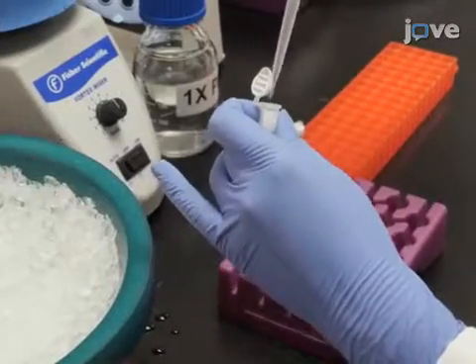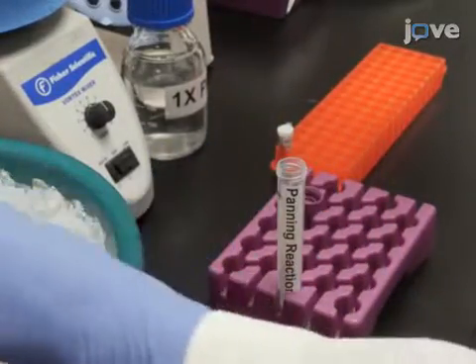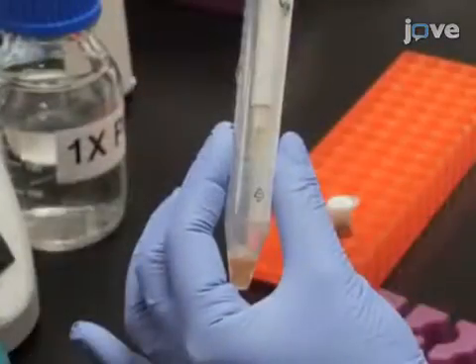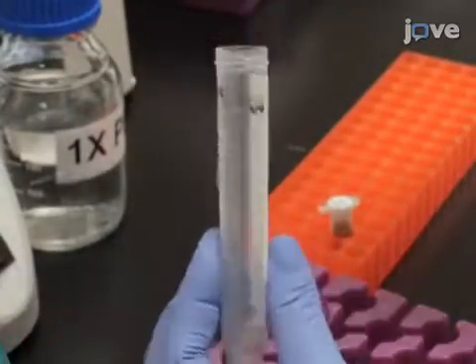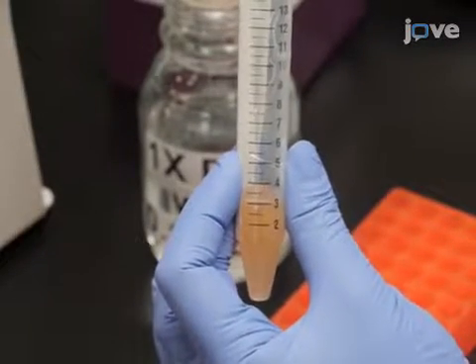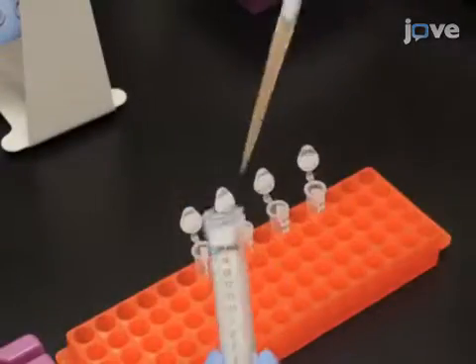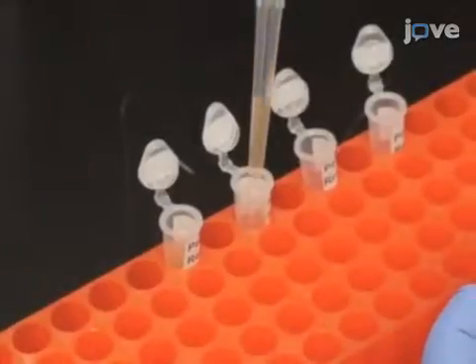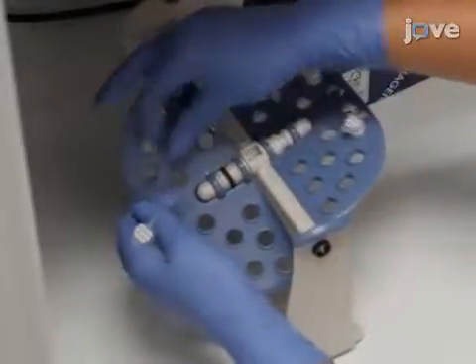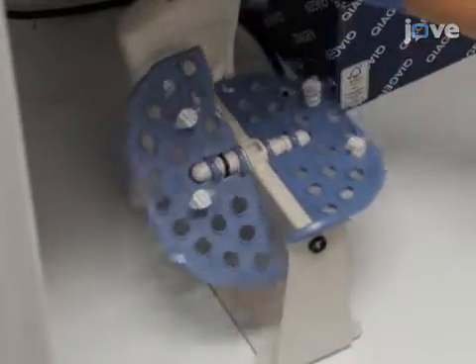To screen the SCFV library, begin by adding 4 times 10 to the 9th spheroplasts and 8 times 10 to the 8th beads to a sterile 15 milliliter tube. Add 1x PBS with 0.1% BSA to bring the total volume to 4 milliliters. Then aliquot the solution into four 1.5 milliliter tubes of 1 milliliter each and incubate at 4 degrees Celsius by gently rotating for 5 hours.